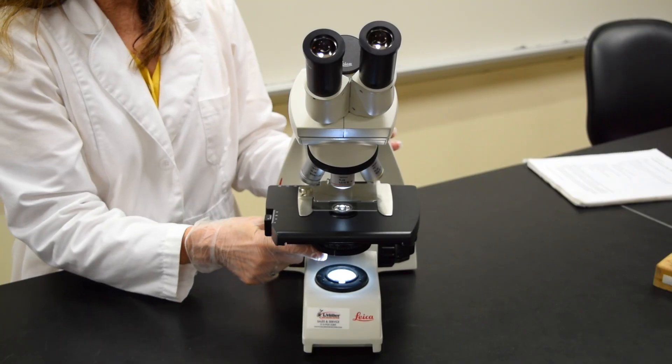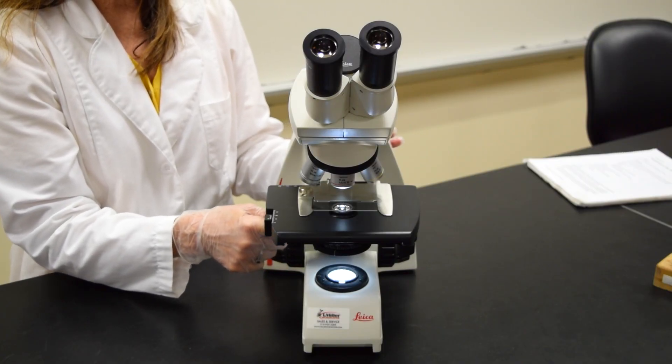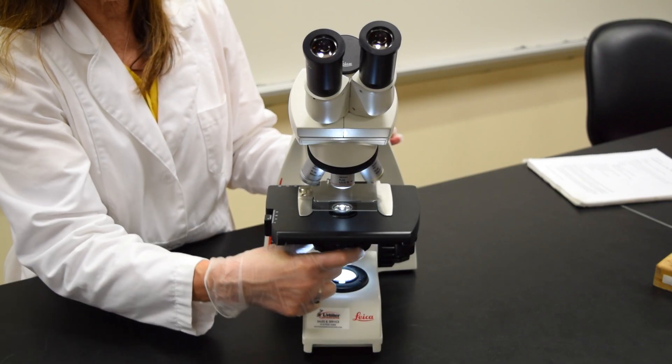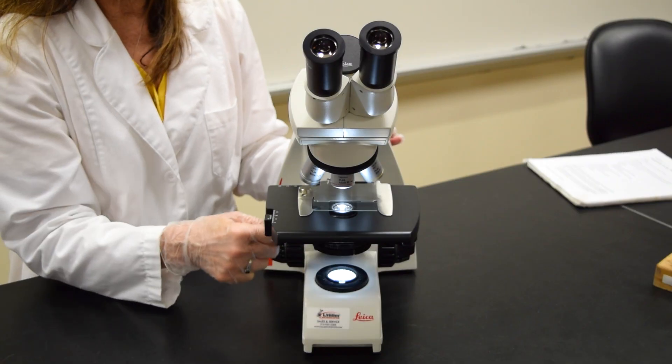Below the stage is the condenser, which consists of a series of lenses, as well as a diaphragm that adjusts the light as it goes through the slide.